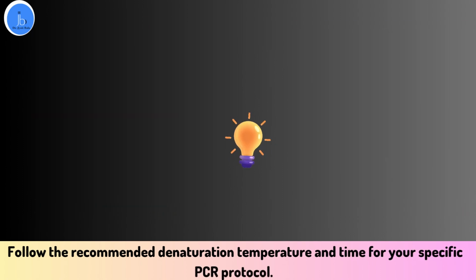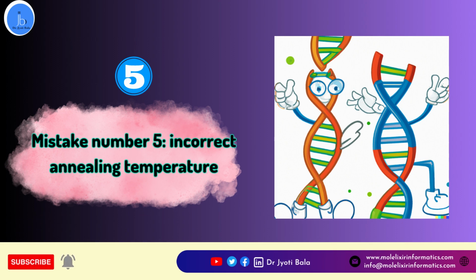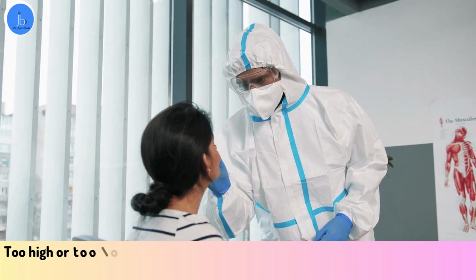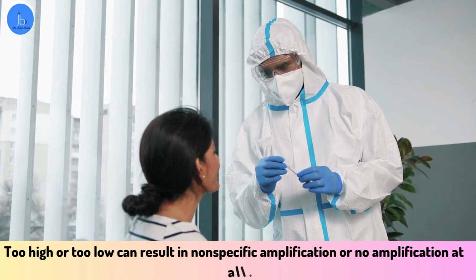And lastly, mistake number 5 is incorrect annealing temperature. Use the appropriate annealing temperature for your primers. Too high or too low can result in non-specific amplification or no amplification at all.